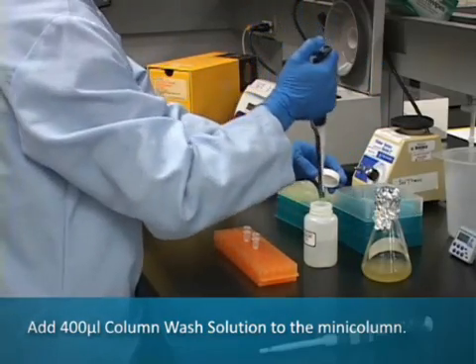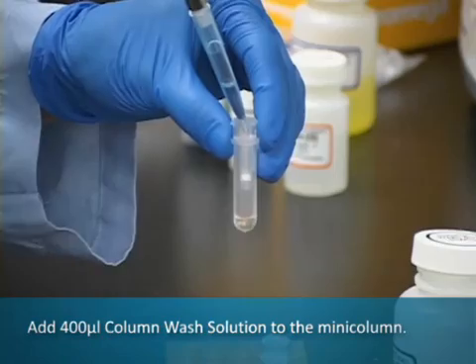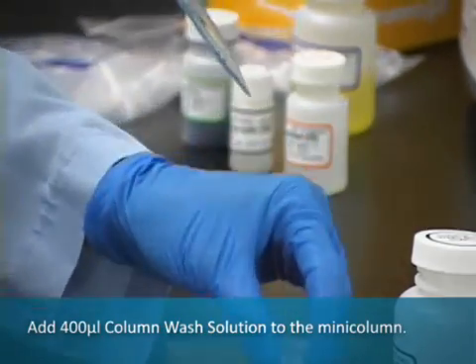Following centrifugation, add 400 microliters of column wash solution to the mini column and centrifuge at maximum speed for 30 seconds.